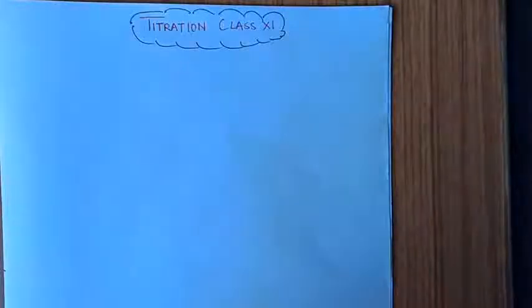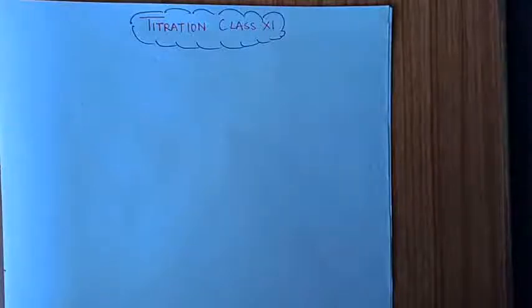Hello children, in this video we are going to talk about titration for class 11th. As for the very first time in 11th class you are going to do the titration. So first of all I will tell you why we do the titration.